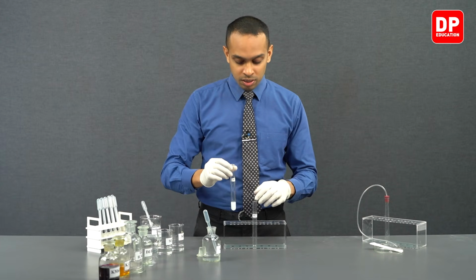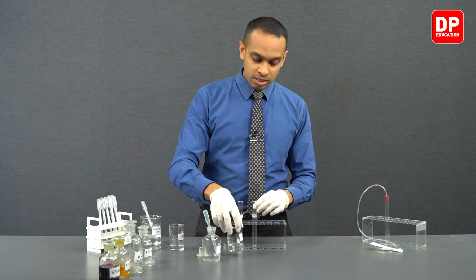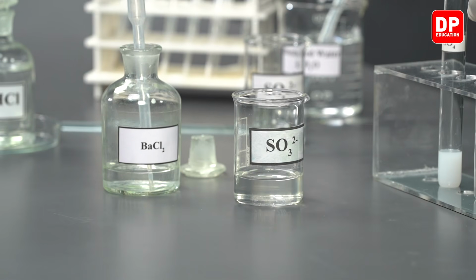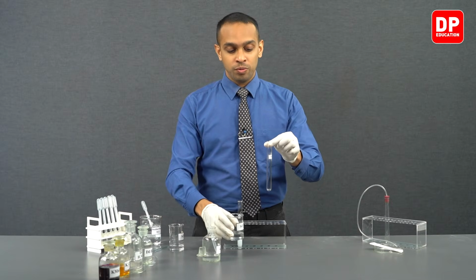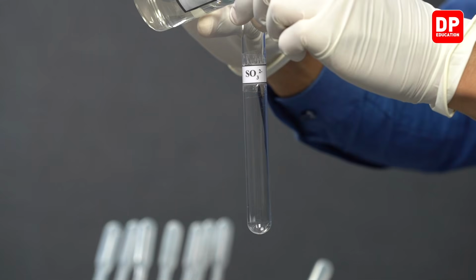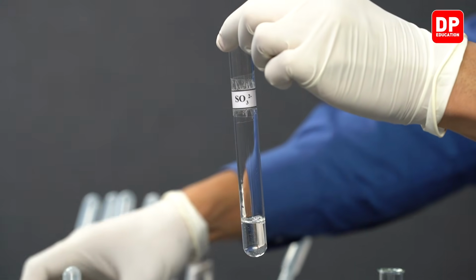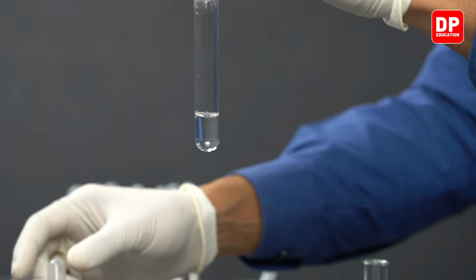Now, let's take a small portion of sulfite ions, SO3 2- ions. So we have a test tube labeled sulfite ions. Now we have taken sulfite ions into this test tube.